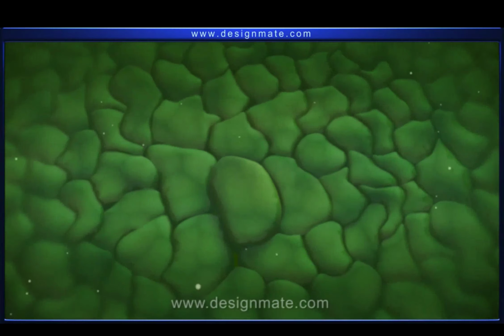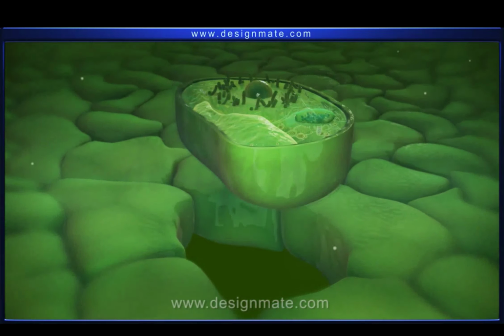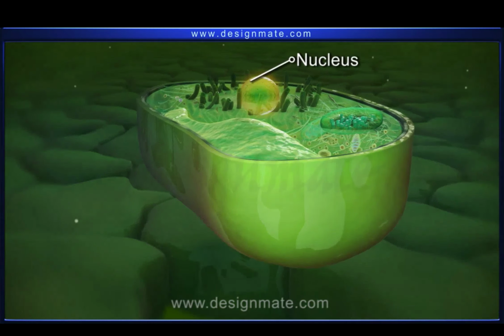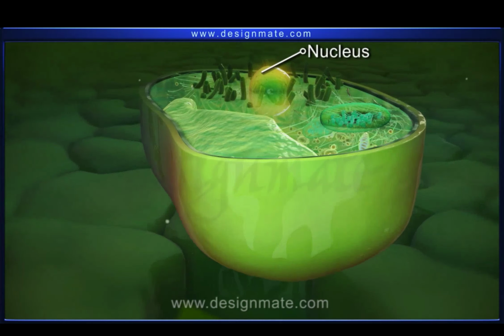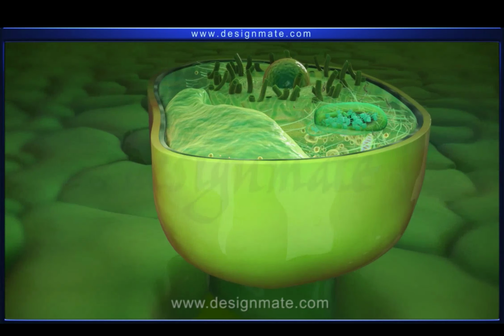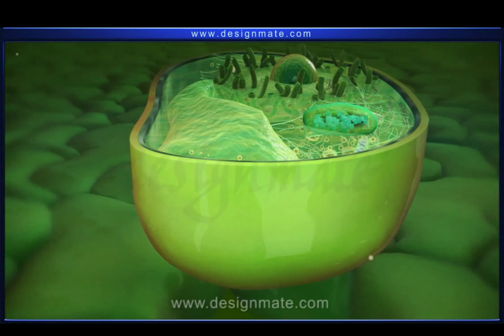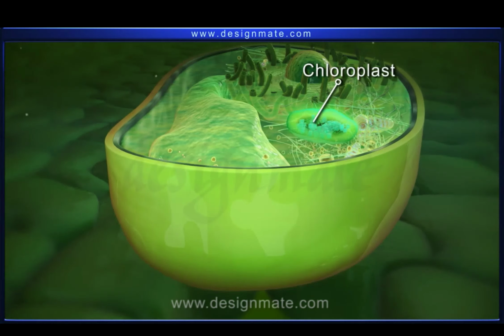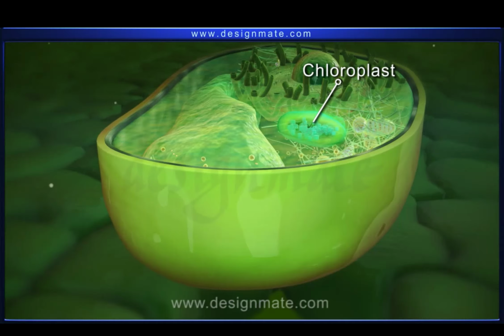These cells look green in color and show the presence of a prominent cell wall and a nucleus. A green discoid structure seen inside the cell is known as the chloroplast.